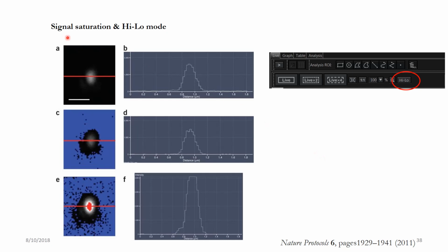Quite often I have seen a lot of people imaging in the pretty color mode, meaning green color or red color or blue color image. It looks great from a biology perspective because it's easy to differentiate between the three molecules that you are trying to visualize, but it's bad because you can only see so much about the intensity. For example, if it is a saturated signal, you may not be able to capture that, and if it is saturated, then you are losing information here, right, which you don't want.